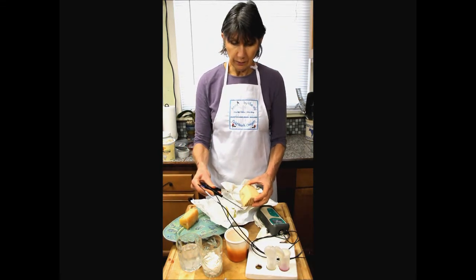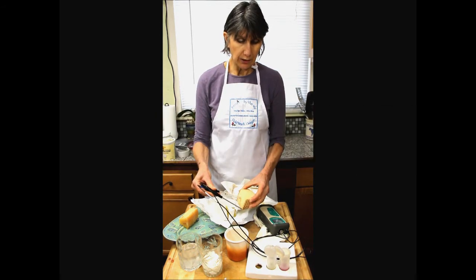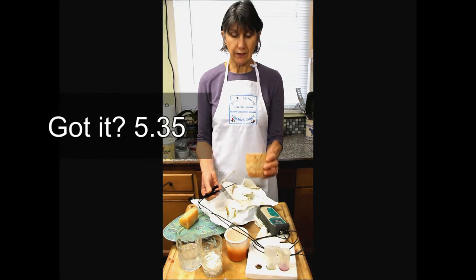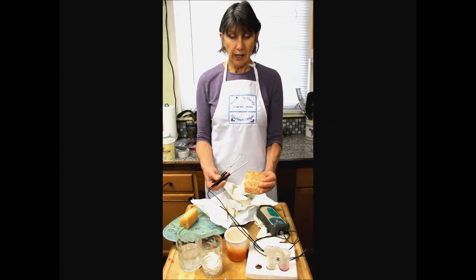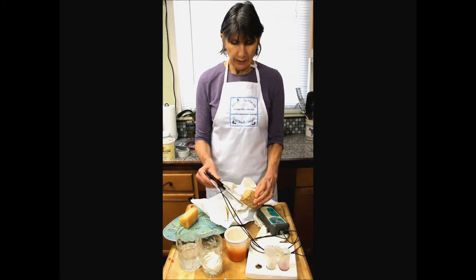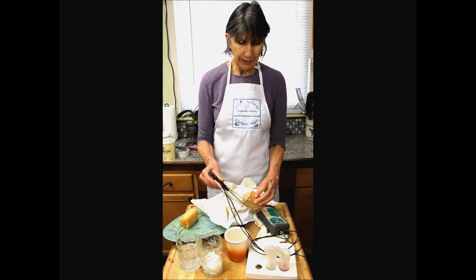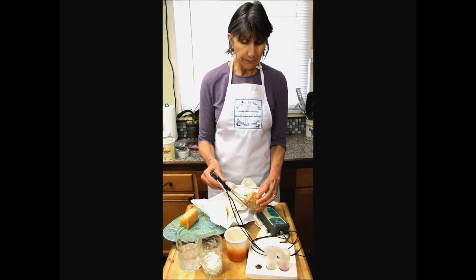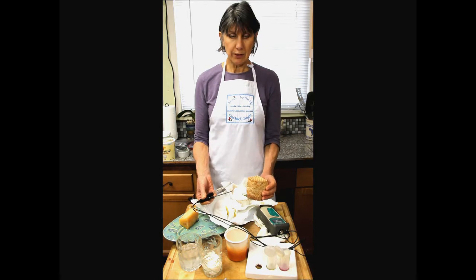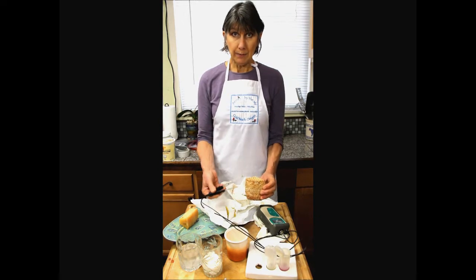This cheese, though, is also stable in the center at 5.35 or so. But because it's a naturally rinded cheese, the surface has been exposed to the environment, and surface microbes, specifically yeasts and molds, will have de-acidified the surface. Now I can just put that little tip right on there, and it's telling me it's zooming up towards over 6, which I'm not surprised at. So the surface is de-acidified. That's one reason that surface ripened cheeses and naturally rinded cheeses are at risk on this surface of becoming post-contaminated.